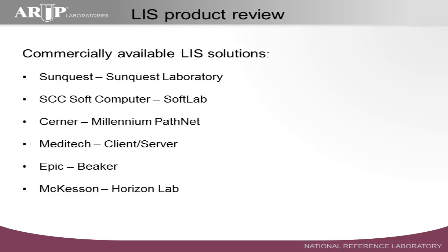And about 5 or so years ago, they decided that they were going to develop their own LIS, because wherever they installed their EMR, there was always some other system in the laboratory. They didn't have an LIS. So they've developed one and they've improved it dramatically over the last few years, and it is starting to gain traction. We do, as I mentioned before, as a reference lab, we do these interfaces with our clients and their lab systems across the country.